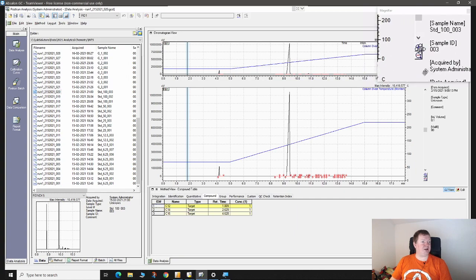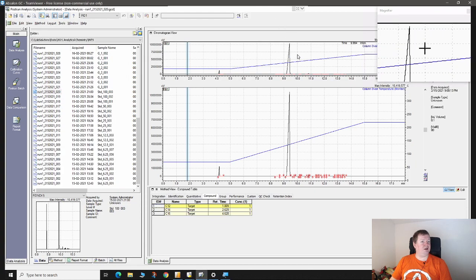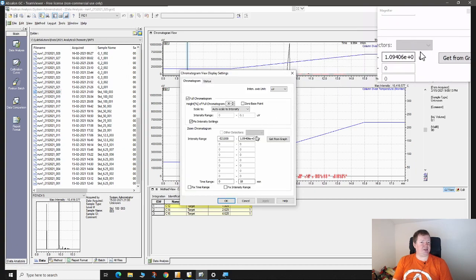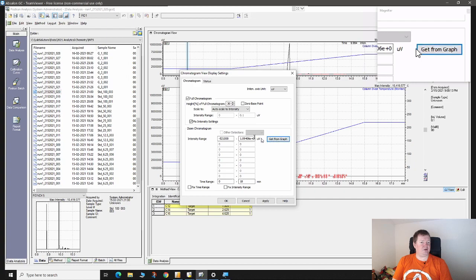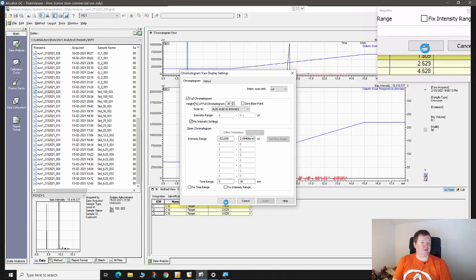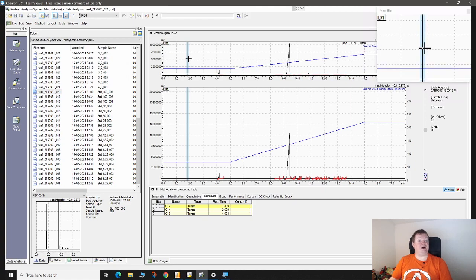I should actually be able, let's see if I can zoom out enough for us to see. Play settings, and let's zoom out even more. Okay, we actually can't zoom out that far.